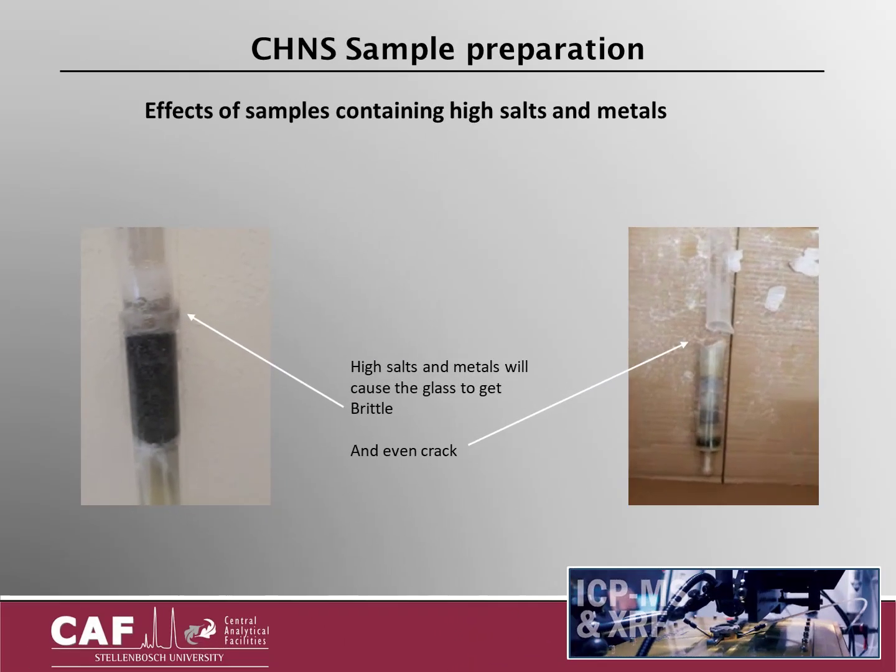There are certain sample types that can pose a problem when either preparing or analyzing the sample. If the sample contains any amount of fluoride, the laboratory will not be able to analyze it. Fluoride has a severe damaging effect on the adsorption column of the instrument. If a sample has residual moisture in it, the sample will not be analyzed. The result is dependent on the mass of the sample weighed, and if the weight of the moisture is included, the result will be skewed.